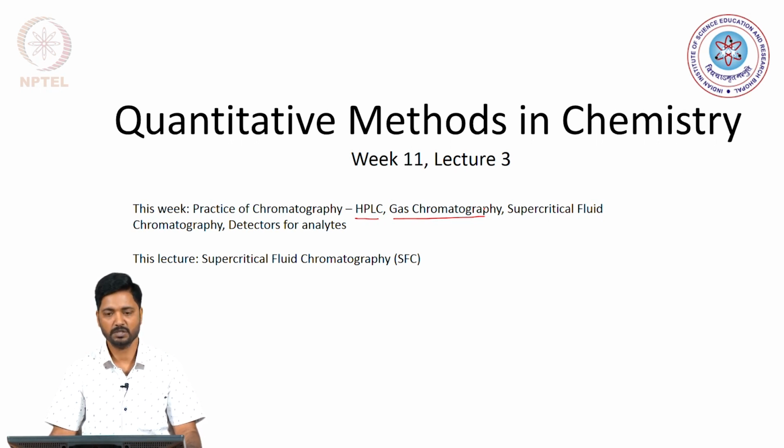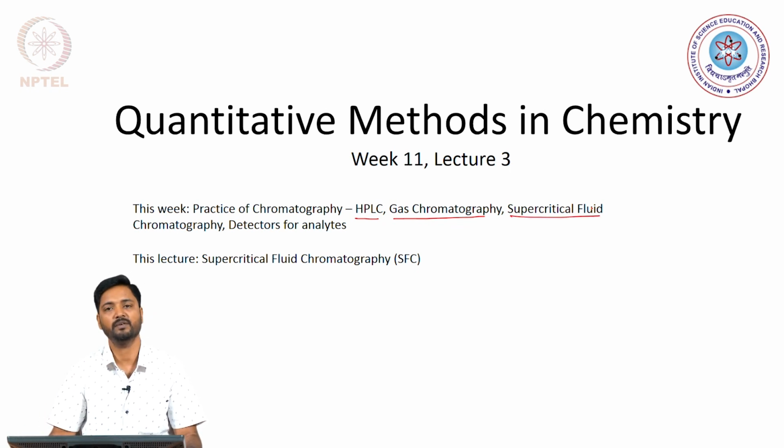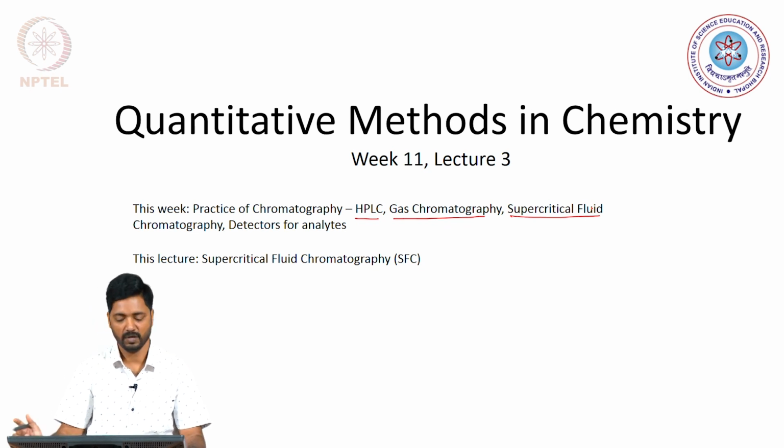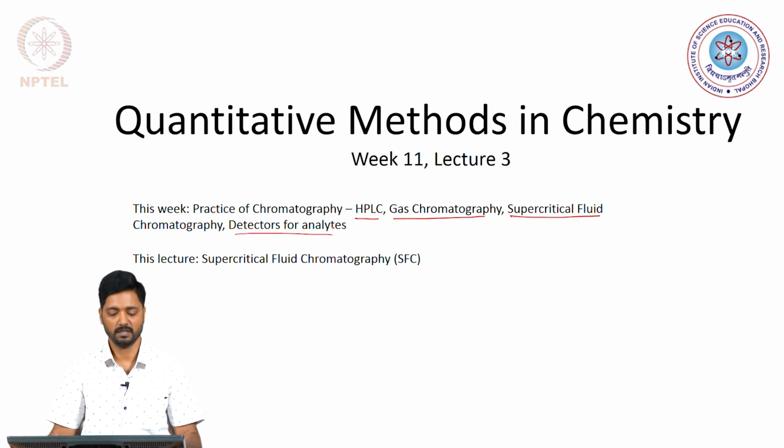So, this lecture our focus will be on the supercritical fluids that are used in chromatographic separations, and the final lecture of this week will focus on the various detectors that are employed in the chromatography systems and the detectors that are commercially available.